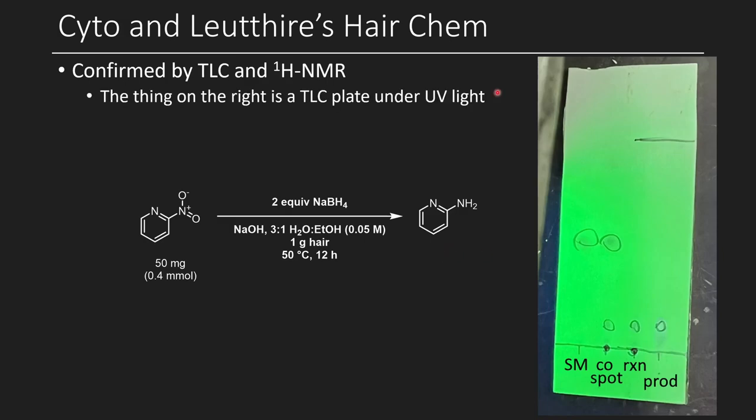As before, we have another TLC plate where we can show the reaction progressing. Here we have first the starting material, which is just the 2-nitropyridine, as well as a co-spot, which both has the starting material and the reaction mixture. Here you can see the reaction mixture on its own, and then here's a standard of the product. You can see that the product, which is the 2-aminopyridine, as well as the reaction, have the same retention factor. They've moved the same amount, and so they're both the same compound.